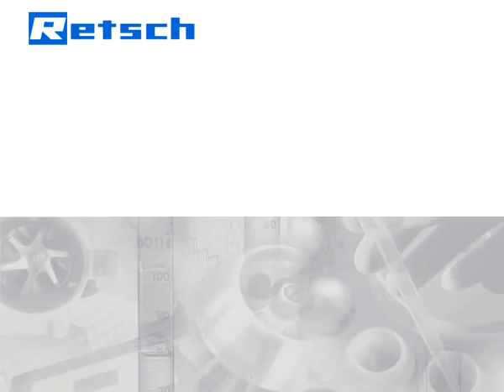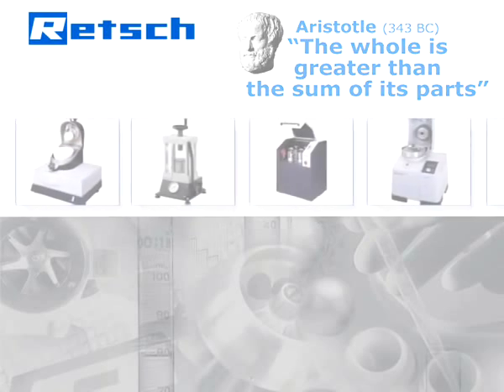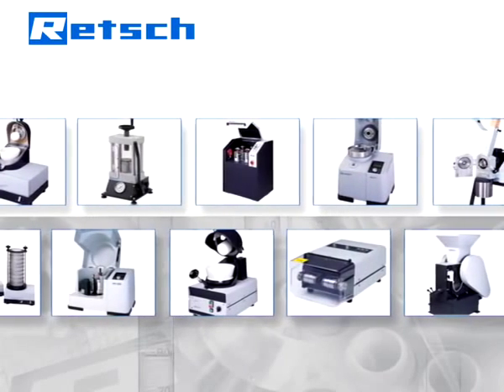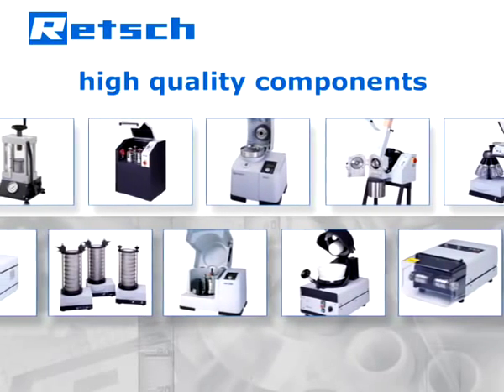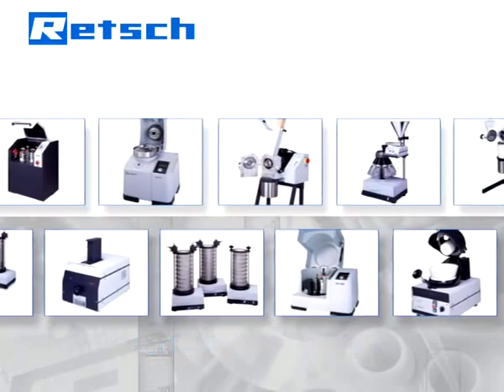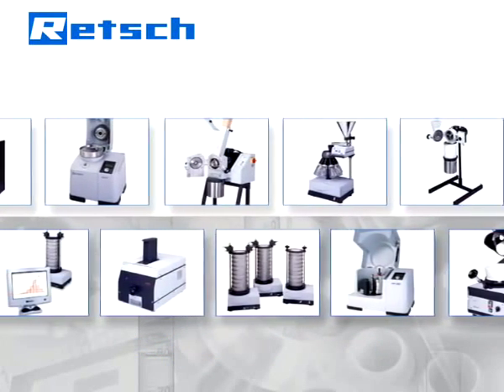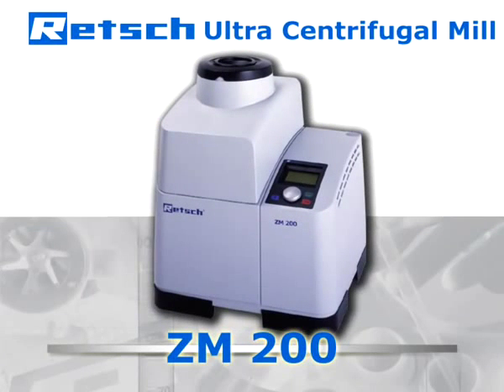Retsch's product philosophy is based on a quote by Aristotle: the whole is greater than the sum of its parts. Therefore, our R&D department does not simply choose high-quality components, but also pays full attention on the perfection of their interaction. It is this approach which determines Retsch's products to be superior and makes the ultra-centrifugal mill ZM200 the optimal device for excellent grinding results.